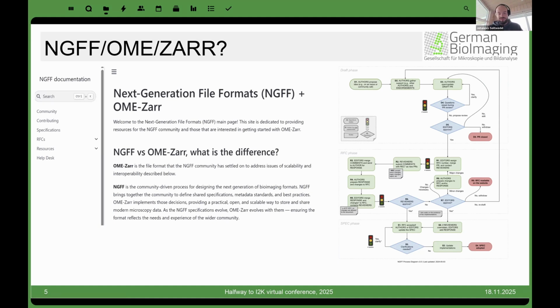And there's a process to follow if you want to make a major change to the standard, which looks pretty much like an editorial process from scientific publishing. You propose something, it's sent to an editor, the editor sends it out to review, the reviewers review your proposal, send you some replies, you get to iterate, major revision, minor revision, hand it in again, etc., until it is adopted and a new version of the spec is published and released.